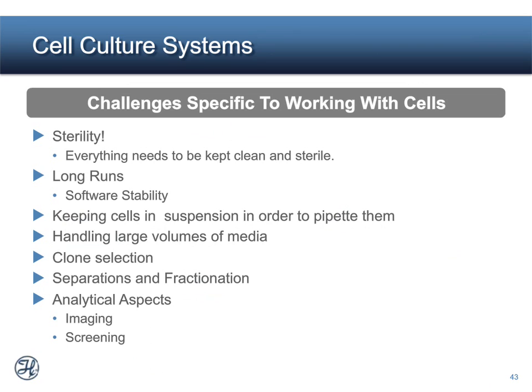Large volumes of media are handled on a cell maintenance system, especially if you're maintaining cells over the course of 3 weeks. You're going to need a lot of media and a way to apply it to the deck, the instrument, where the pipetter or the liquid handler can handle it.